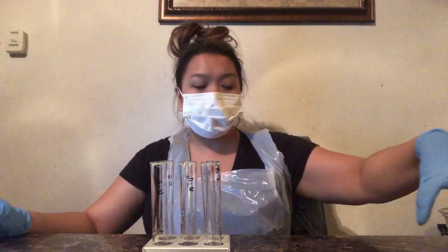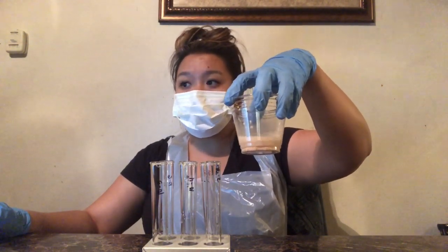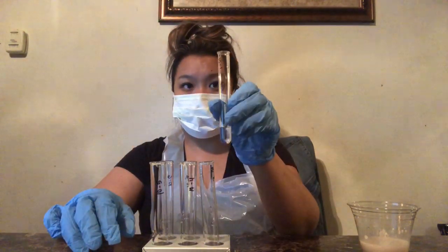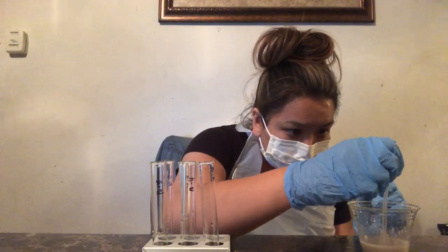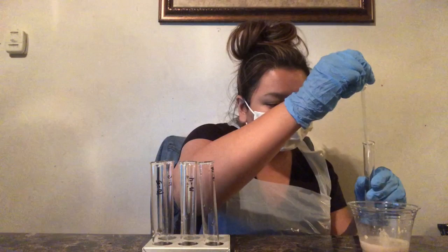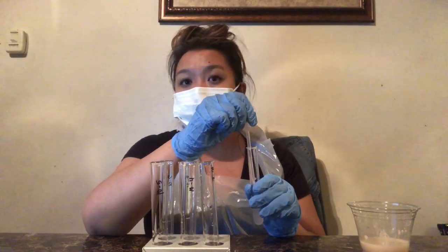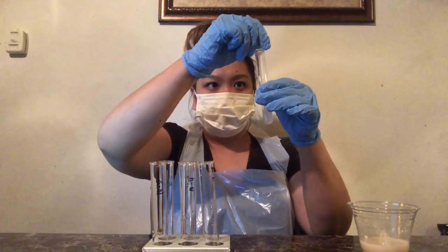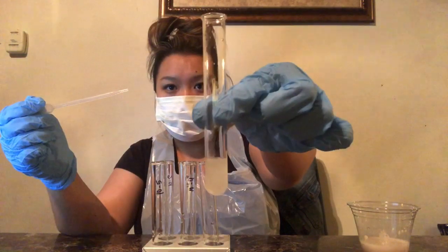Now I'm going to swirl the yeast just to make sure that the organism disperses evenly. I am going to pipette 0.25 milliliters of this into test tube 10-1, which is this one right here. The instructions tell me to pipette the solution up and down several times just to ensure that it gets everything, which I'm going to do. Okay, so I think it's all there. This is what it looks like.